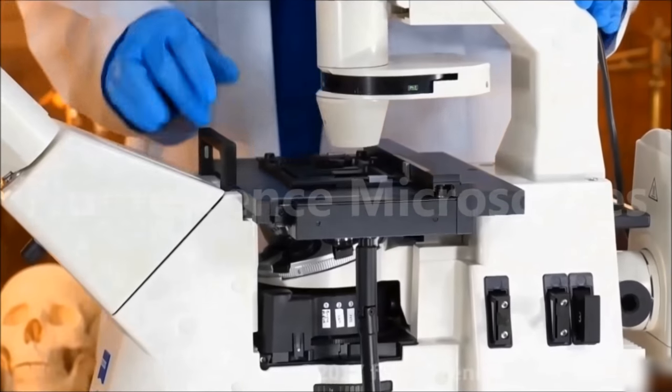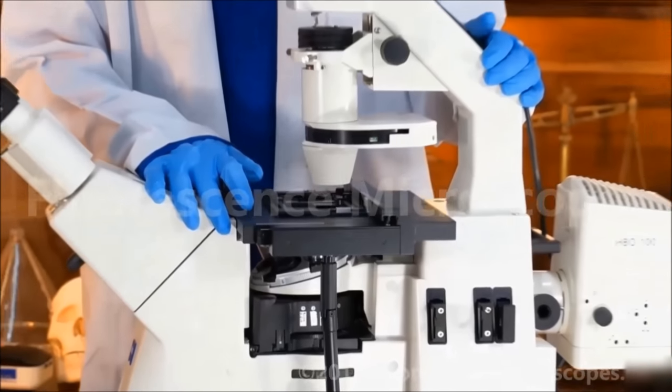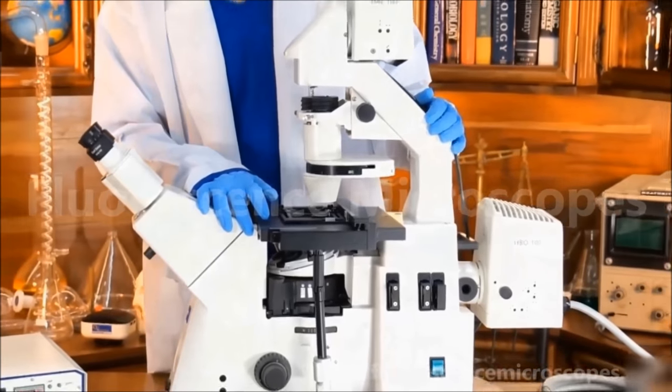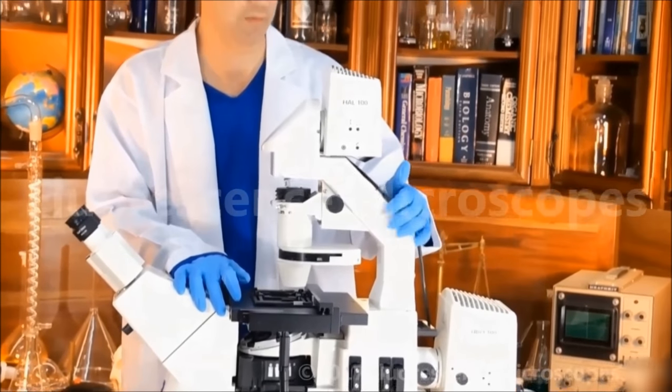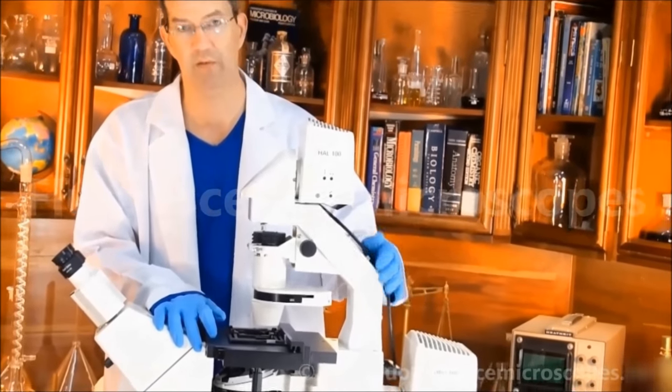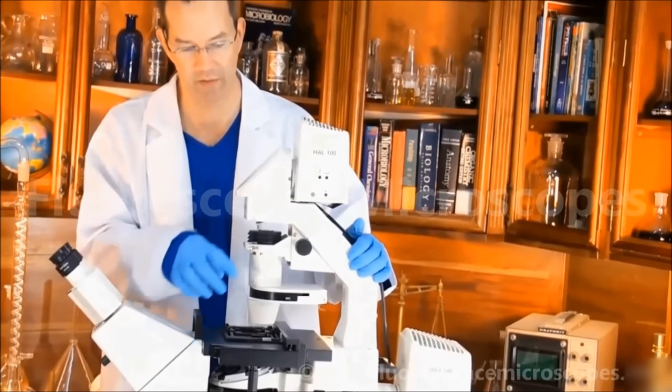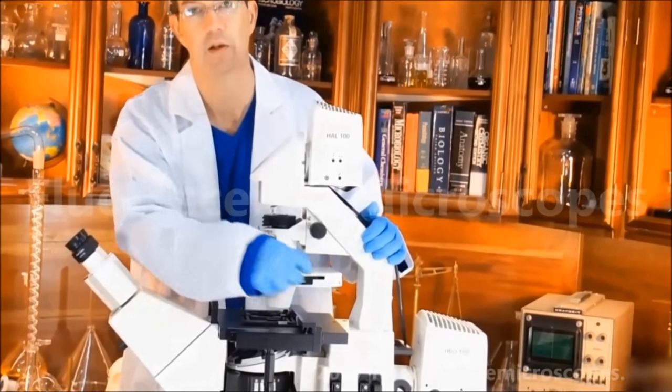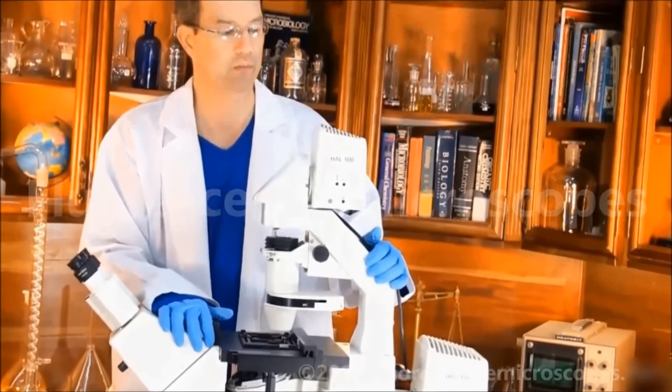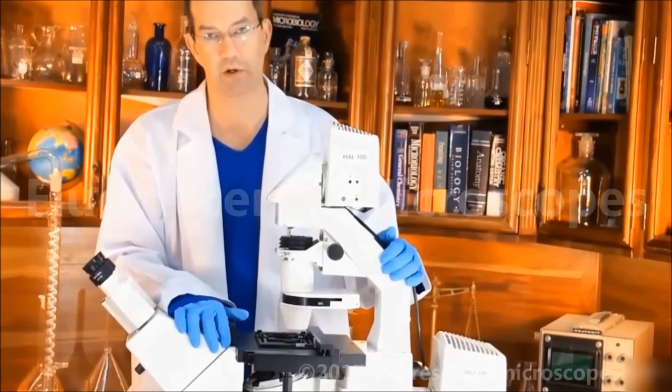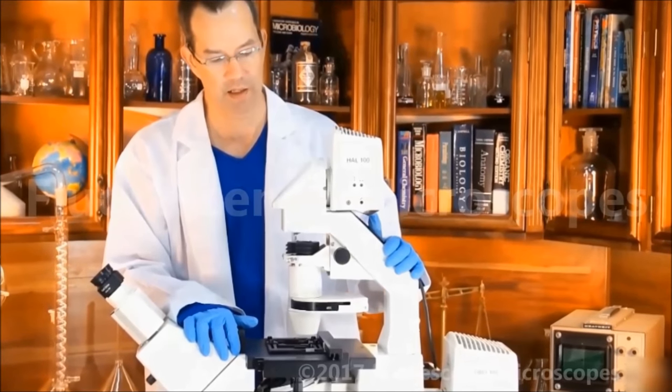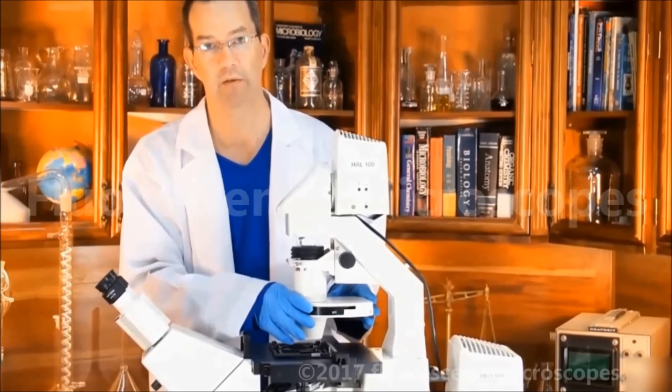When you start looking at other Axiovert 200 systems, some of them have a very simple transmitted light system. They have a very simple arm. They have a very simple slider. It's almost just a bar that slides in and out from the phase contrast system, and they're 30 watt. This is the full version that has the 100 watt and the rotary condenser.